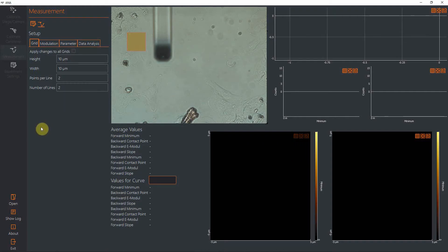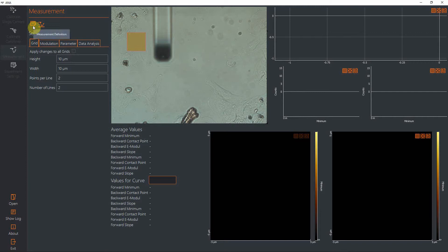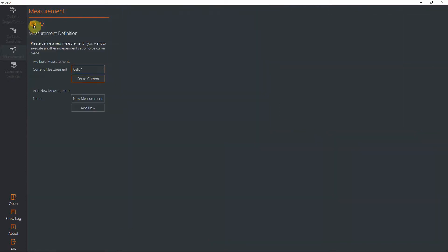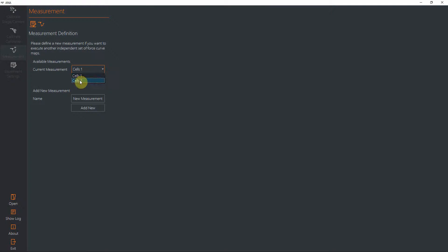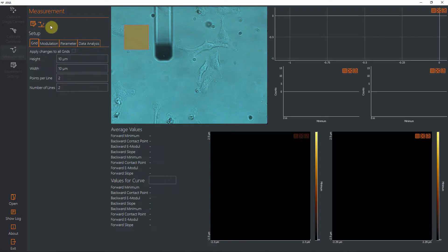During an Anna measurement session, you can do a number of different measurement rounds that you can have in different folder structures. For example, after changing the area or changing the sample, you can access these different measurements in the measurement definition. You have a dropdown here. I have two: cells one and cells two. You select the one that you would like to look at.